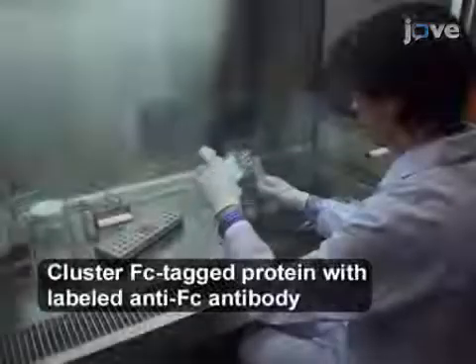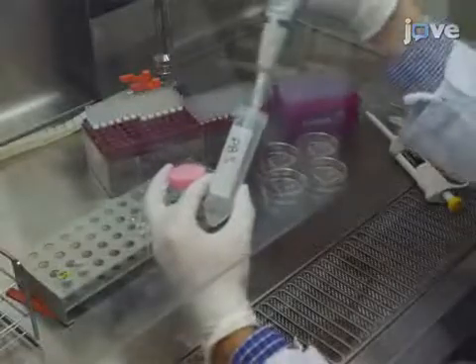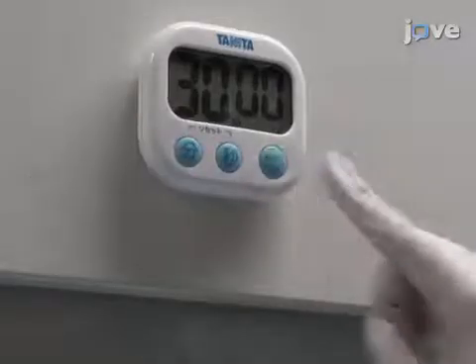Prepare the fluorescently labeled recombinant proteins in PBS. Make 25 µL for each striped dish. Let the mixture incubate at room temperature for 30 minutes.